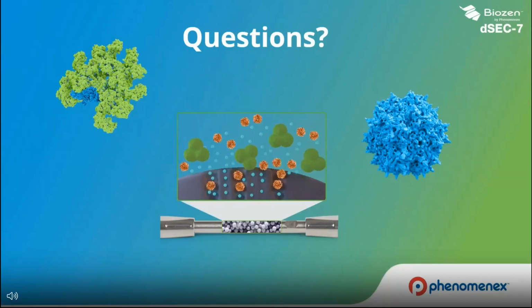If you do see or suspect that there could be something that could be clogging up your system, this is again particular to HPLC or UHPLC, where the tubings are very, very narrow, then you would at least try to centrifuge it, at about 10,000 RCF, or, if you have sufficient volume, filter it through a 0.2 micron filter, and then analyze from there.